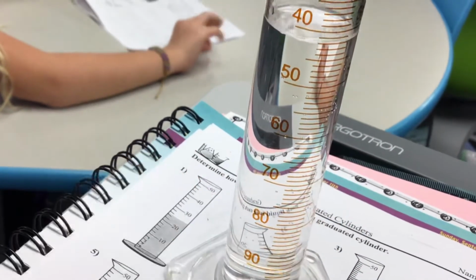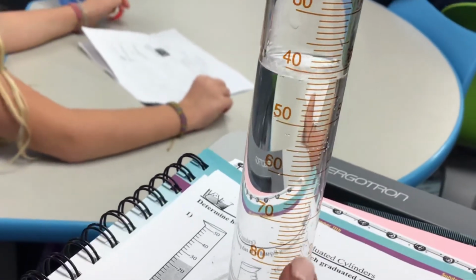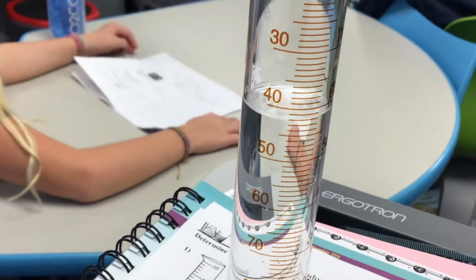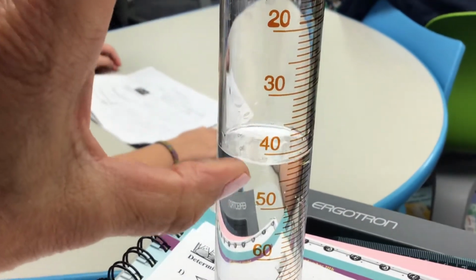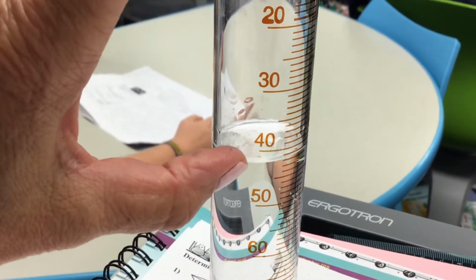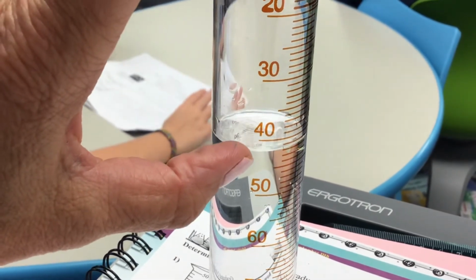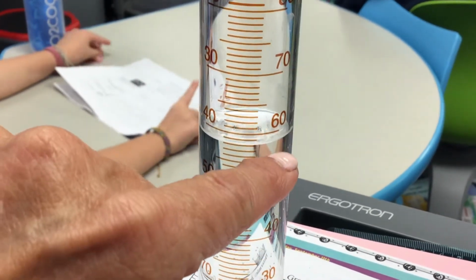Okay? And if we came up to here, it wouldn't be 90, it would be 10. And if we come up to here, it wouldn't be 80, it would be 20. These numbers on the left are how much you poured out. If I went and poured some out, you would see, oh, she poured out 8 milliliters. Or, oh, I could still add 42 milliliters of water here. That's how much room is left. Over here, it's telling you how much water is in there.